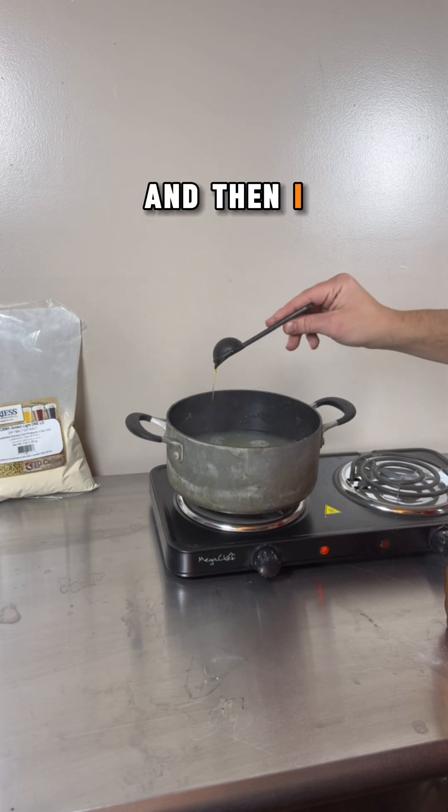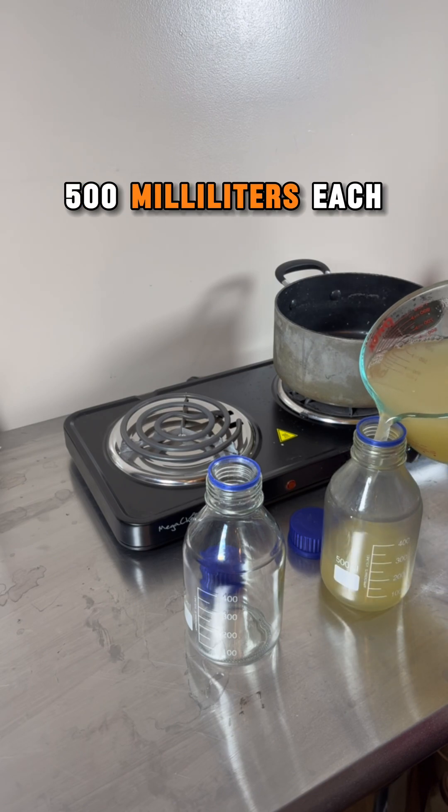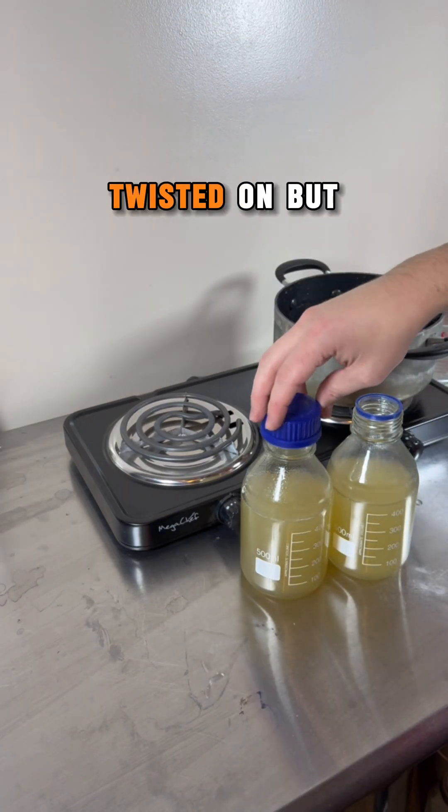Once the potato water has warmed back up, I add the powders and stir until dissolved, and then I add one tablespoon of honey and stir again. The agar solution is then poured 500 milliliters each into two media bottles — or you can use regular jars if you want.